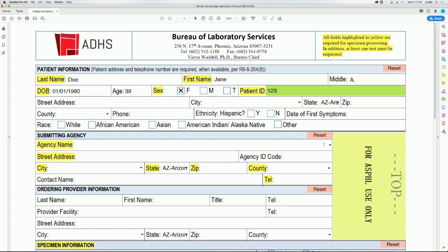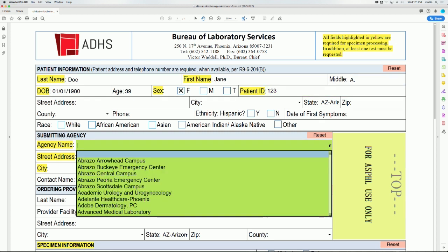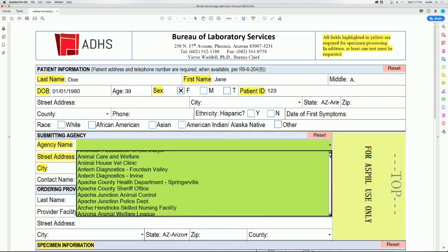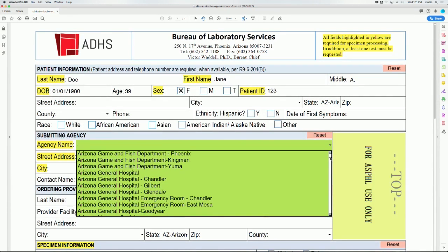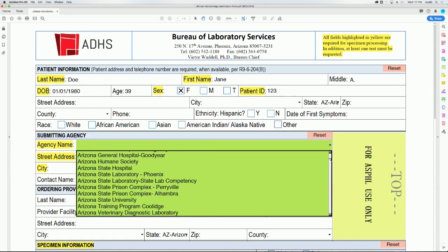When filling out the submitting agency name, click on the drop down arrow to select the appropriate agency name. Be sure to verify that the correct address and phone number auto-populates.